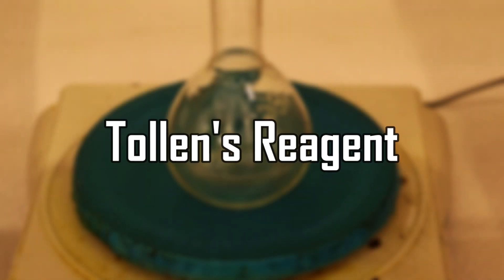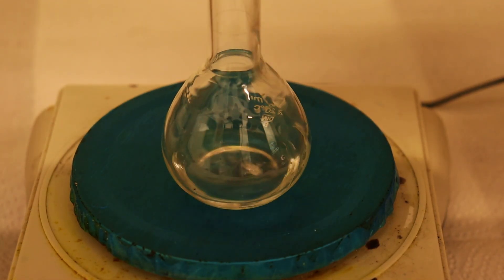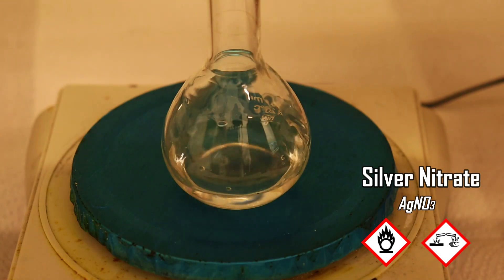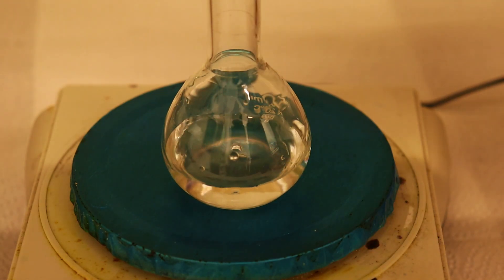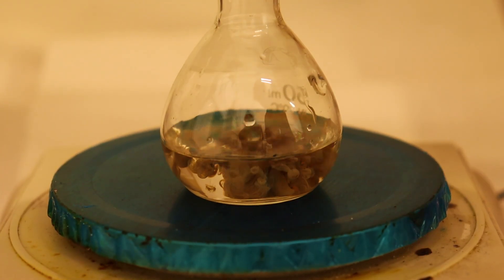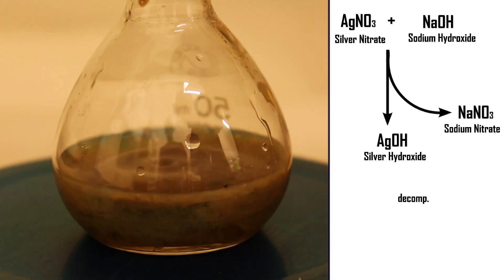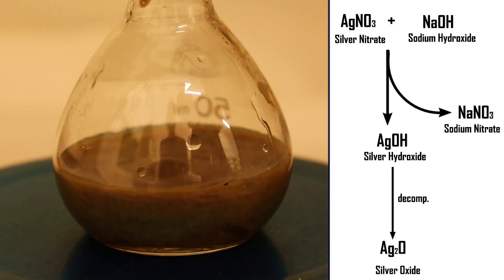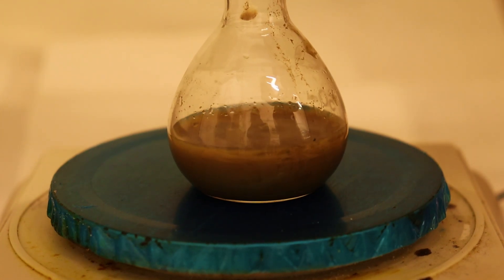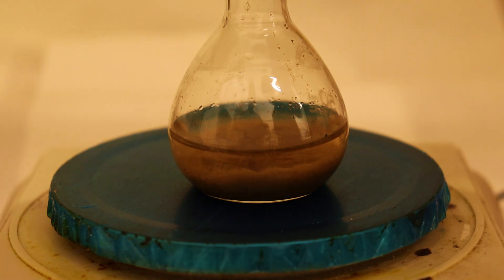To start the Tollens' reagent synthesis, it's pretty straightforward — you need to mix the three chemicals in the right proportions. Firstly, you need to measure out some dilute silver nitrate solution. Then to that you add some drops of sodium hydroxide solution. A brown precipitate should immediately form. The reaction here produces silver hydroxide and sodium nitrate, but the silver hydroxide formed is unstable and it immediately decomposes to silver oxide as this brown precipitate. Next, we need to add some dilute solution of ammonia, around 10%, until all of the oxide dissolves, forming our Tollens' reagent.